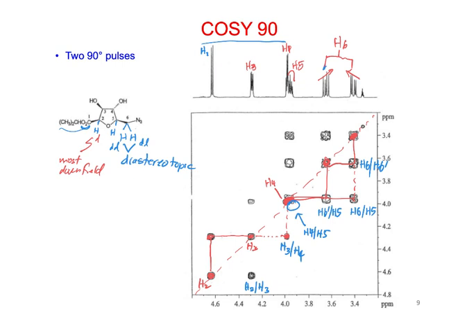But notice, the big couplings are slanting towards each other. And then notice these small couplings are slanting this direction, at least on this one. See these two peaks here, and those two there are slanting, saying they're coupling over here. These are more horizontal because they're farther away from H5. And so these are more first order, the small coupling. These are slightly second order.